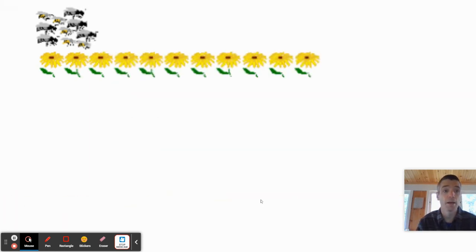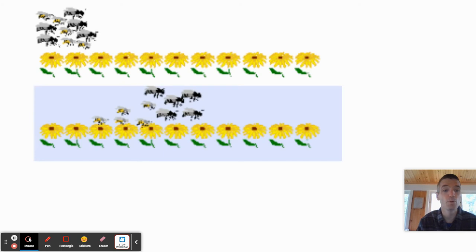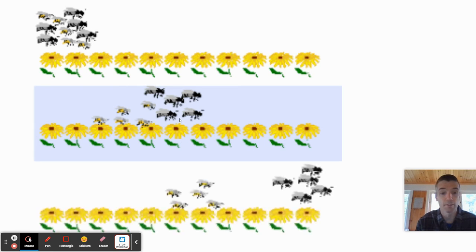Now, they're flying over this group of flowers. You can maybe guess that this is the stationary phase and this is the mobile phase. As they move over the flowers, the bees are naturally drawn to the flowers because they like the pollen in them. And you can see that the bees and the hornets are now starting to separate. And there it's happening even more.